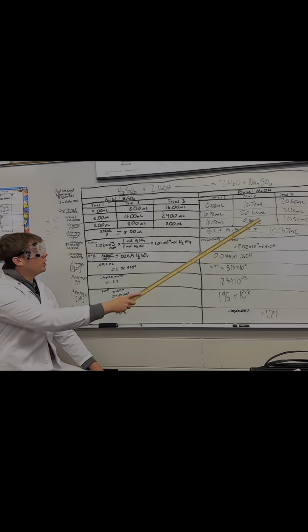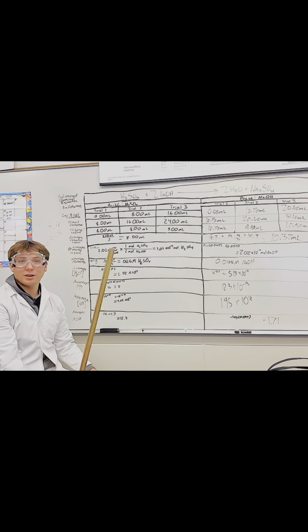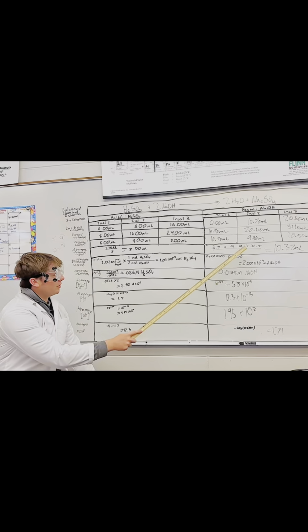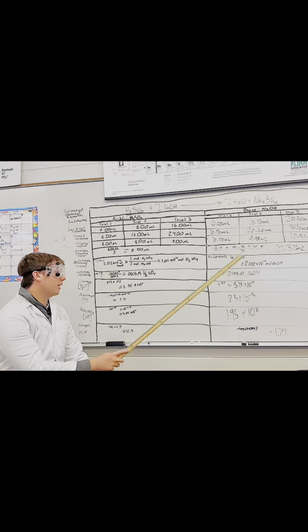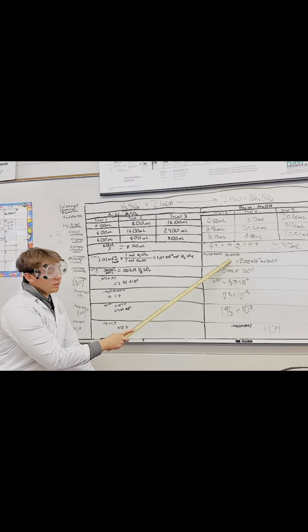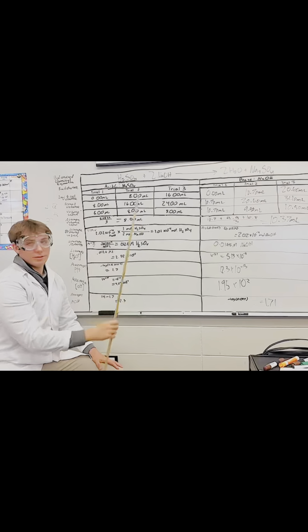So, moving on to our third acid, sulfuric acid. We see over here on the base side, the average hydronium concentration, the average pH, the average hydroxide concentration, and the average pOH all remain the same as the two previous bases. The only change to data here is the average volume used and the average number of moles used, which is calculated by finding the average volume used converted to liters by dividing by 1,000, multiplied by molarity.